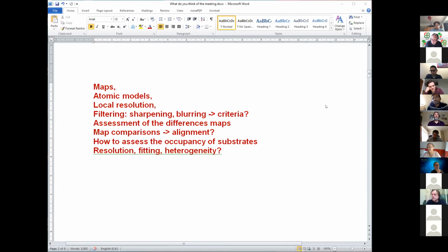My best high resolution map is 2.7 angstrom. It's the highest resolution which I have achieved in my data. But I was not able to trace any polypeptide chain from the very beginning until I saw at least one alpha helix that is supposed to be in the structure. For that, I did blurring. I did low pass filtering to see only the regions where I have a helical arrangement and where I have beta sheet. Then I started to trace from there. Then I came to the high resolution.